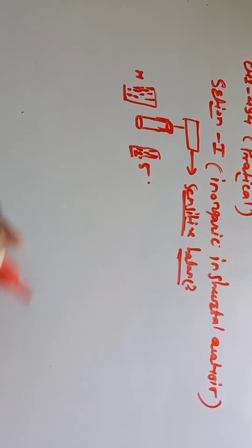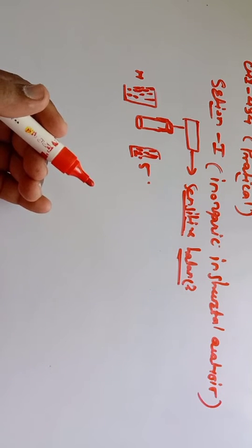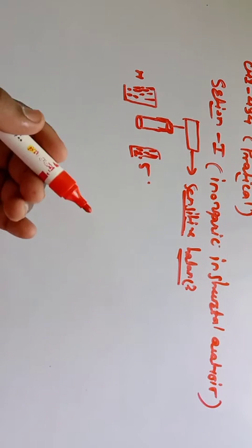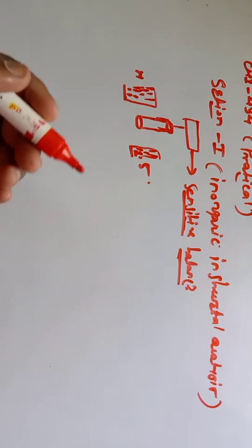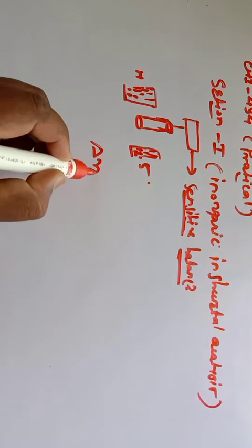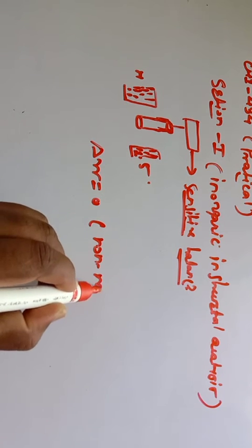So if the weight change is positive, meaning delta W is positive, it indicates the material is paramagnetic. If delta W is zero, that is, the change in weight is zero, then it is non-magnetic material.